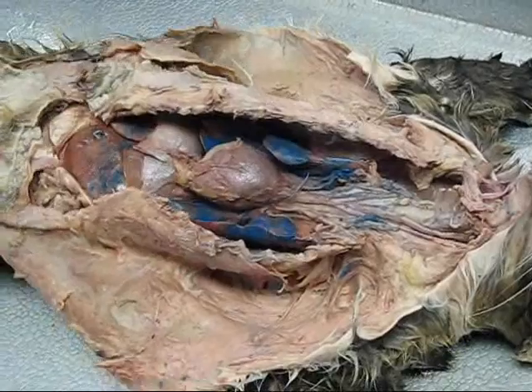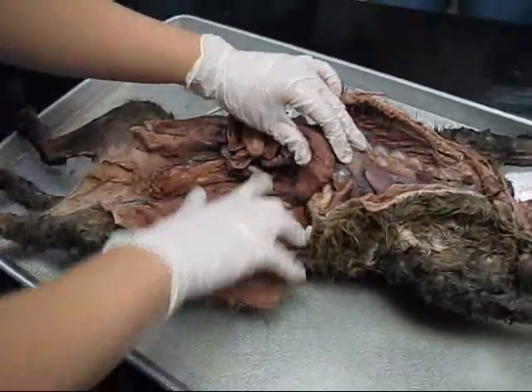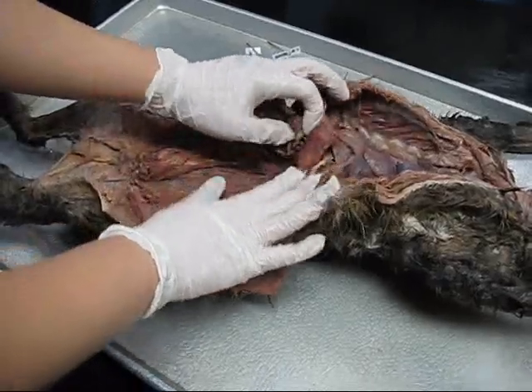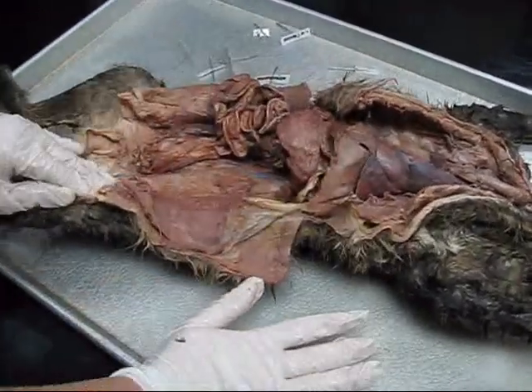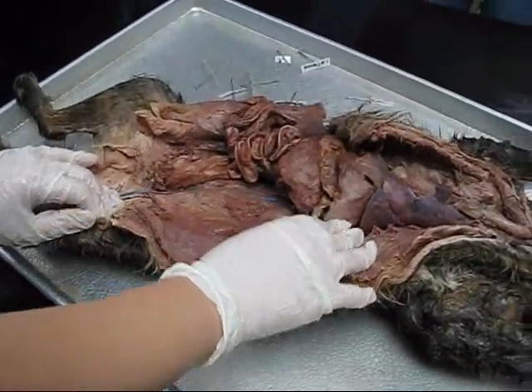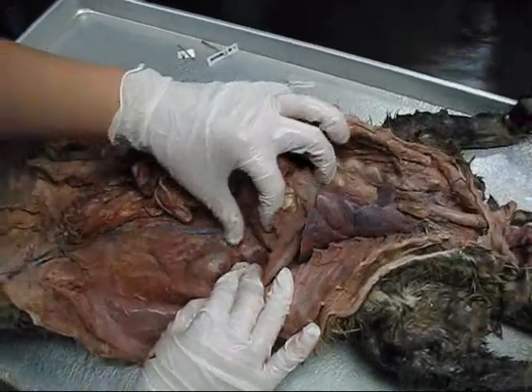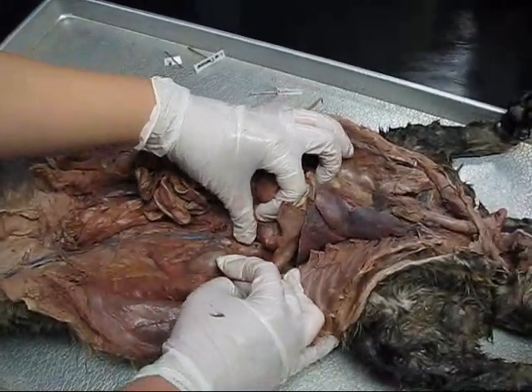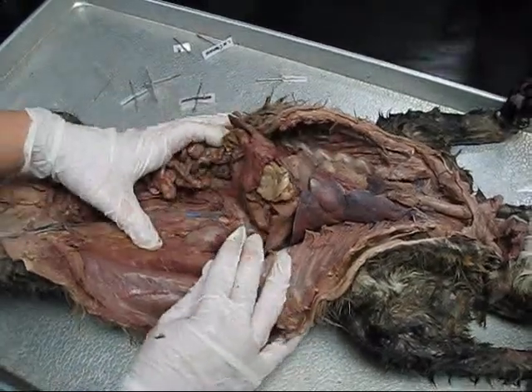I'm going to pull out one of our lower cats and do the lower veins and lower arteries. So the big one running all the way from the top is the inferior vena cava — the whole stretch here. Now you have a couple of things to know coming off the inferior vena cava. The diaphragm is right here. You have two that you have to know coming off the middle portion: the adrenal lumbars, which are up above — here are the adrenal lumbars. Remember your adrenal glands are on top of your kidney. And then you have the renals, which are going to the kidney, coming off here.